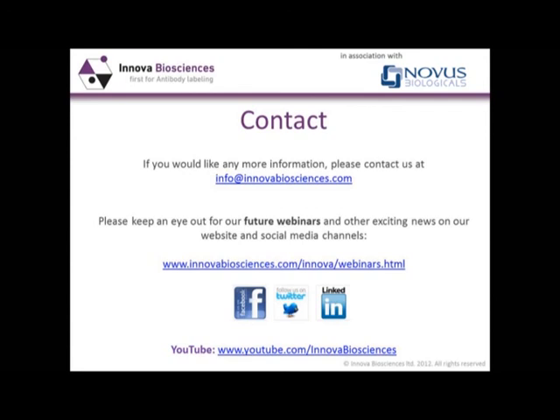Okay, we also, yep, go ahead, Danny. Okay, thanks, Graham. There was a question from Erin regarding the lightning link times moving from 3 hours to 20 minutes, or the kits that I mentioned in relation to that. The standard lightning link kits have that 3-hour incubation time. If you go to the Innova Bioscience website, you will see a series of so-called rapid lightning link kits, which are a new generation of kits available to undertake the 20-minute conjugations.